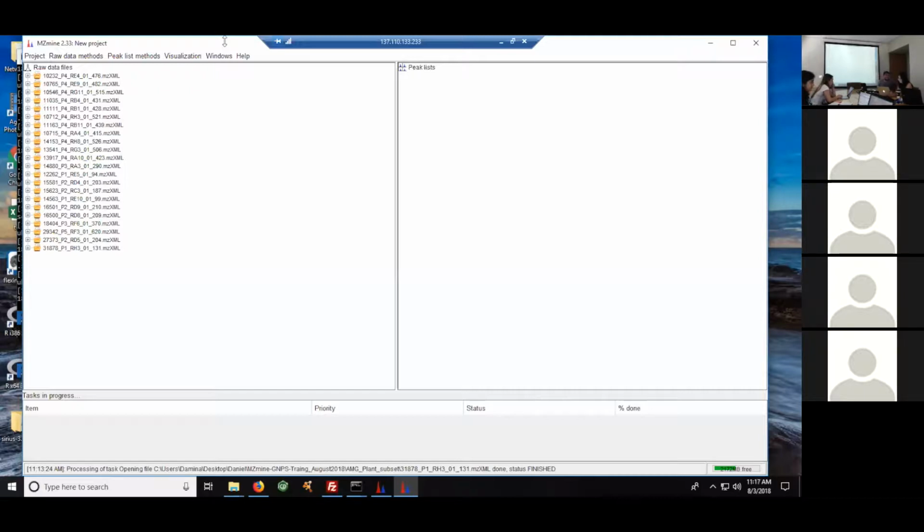And then Daniel's having problems getting files as well. We tried. Did you get it? I don't think you write to home. When you open FileZilla, did it tell you to upload? I don't think you write to home. No, you actually put it on the desktop, not the audience. That was my issue. I just fixed it. Okay, great. I think you did not copy the link. If you go to display, right there, and then go here.